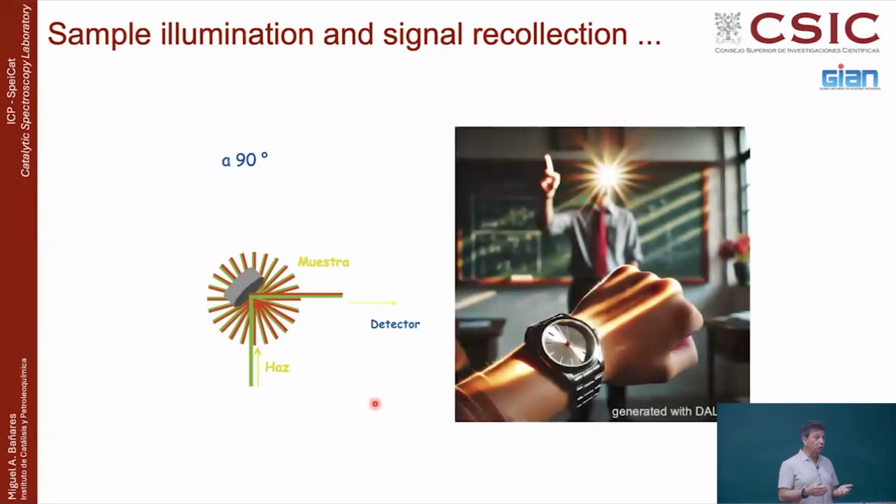Like something you do in classes, and the professor is like, ah. Okay, I did that when I was a kid. And it really helped me a lot because the first time I was doing Raman spectra, I was working on this 90 degrees configuration. And then you have to play with the sample, tilt it and orientate it until the light is reflected to the detector that you can hardly see.